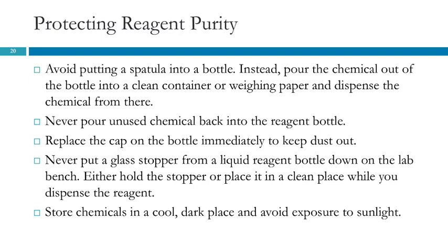Replace the cap on the bottle immediately to keep dust out. Dust has stuff in it, right? Dust is made out of chemicals. Dust falling into your reagent could have traces of that trace analyte that you're analyzing for, and it's going to mess everything up. And would you even notice? Not really, probably.